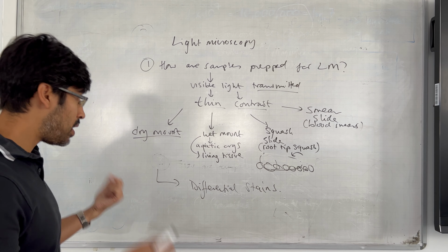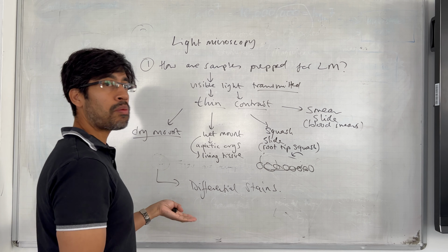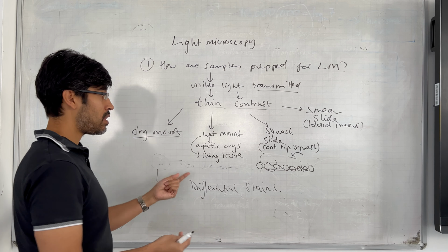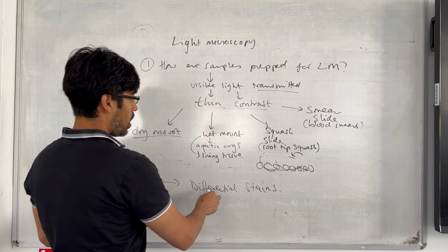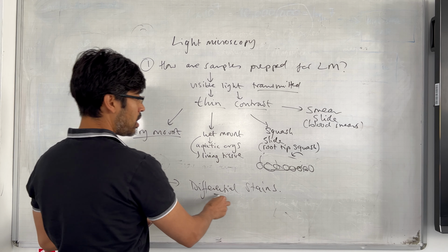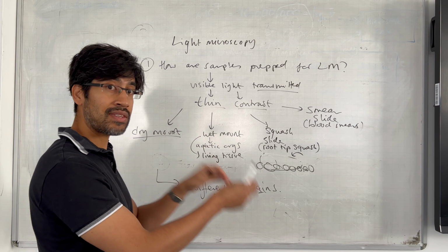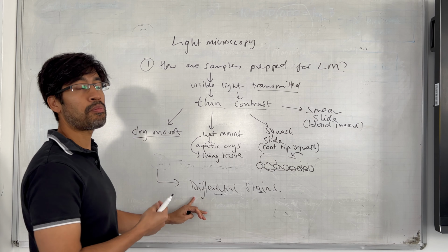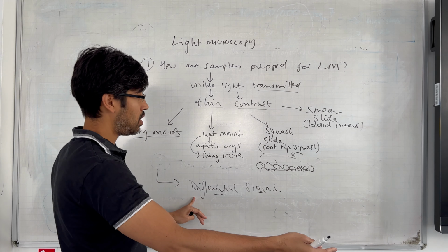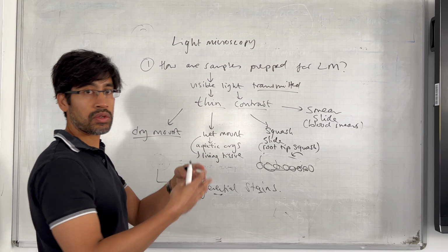stains. Now these are pigments, these are chemicals that have certain properties, and because of their chemical properties, well, one thing, they are always colored. Okay, so they are pigments. They might be red, they might be blue, they might be purple, whatever it is, but they have a color. But because of their unique chemical properties, they also tend to bind to certain things in the cell. So if it's a positively charged differential stain, it's going to bind to DNA, which is negatively charged, and so then we can use that to highlight the nucleus or the DNA in the cell.